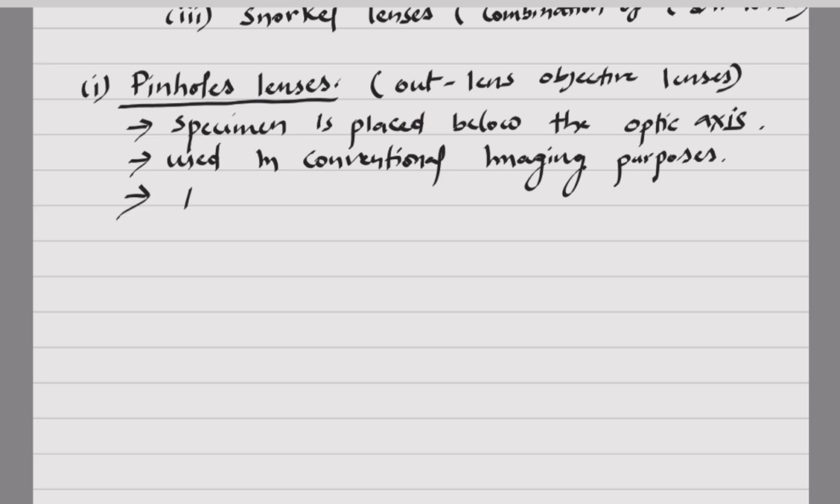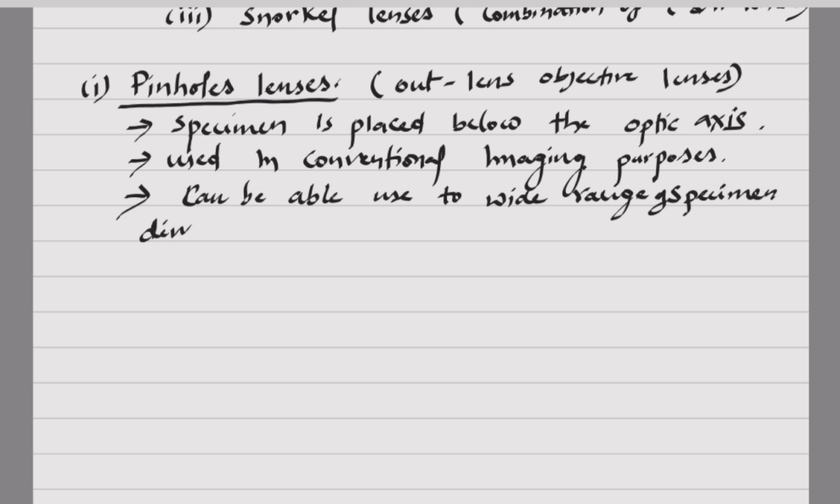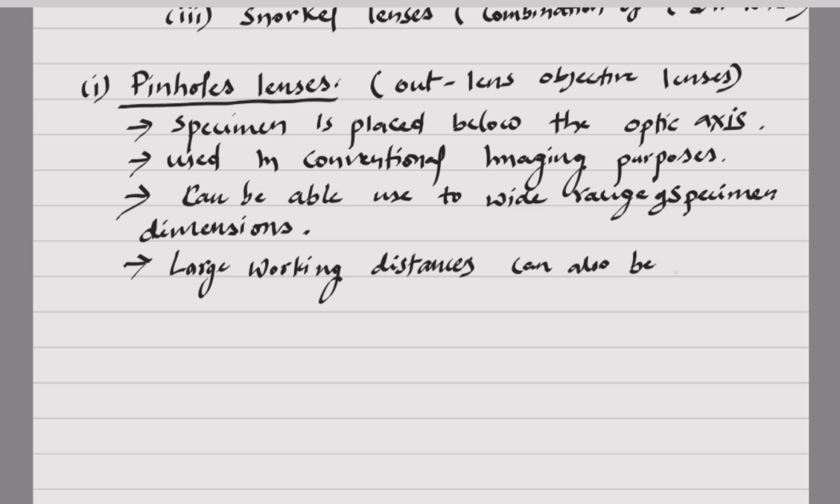So a wide range of specimens and specimen dimensions can be used, and large working distances can also be used.